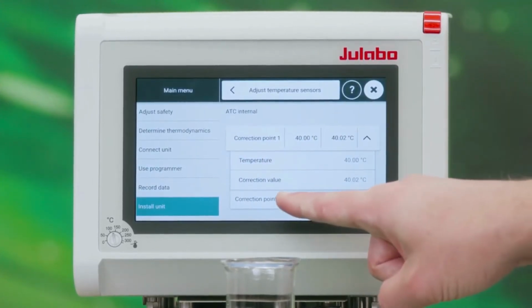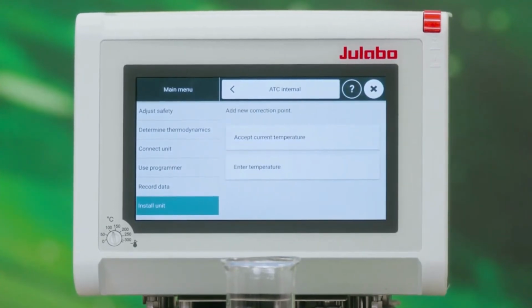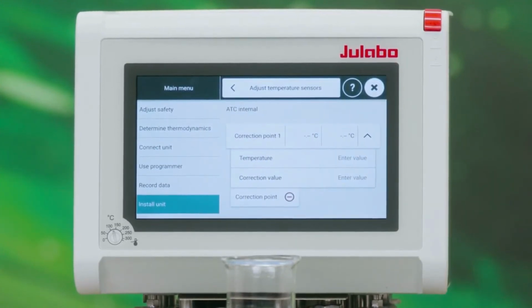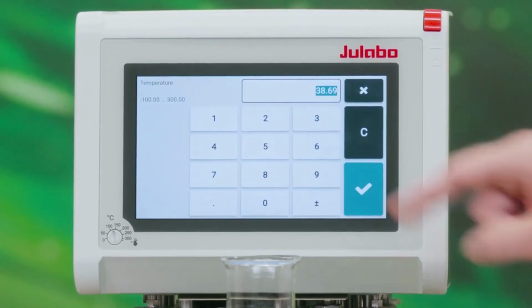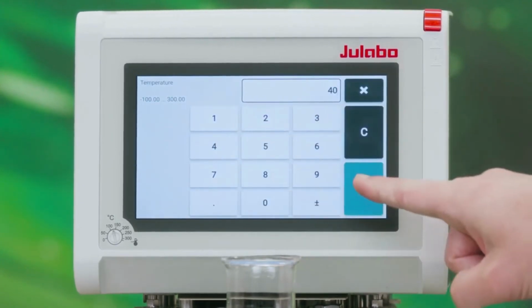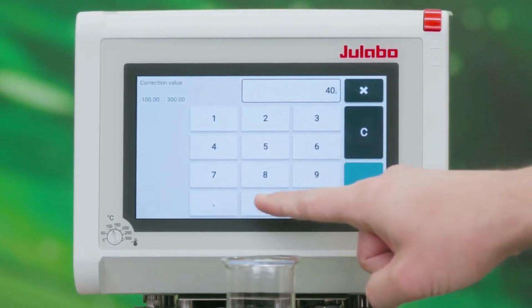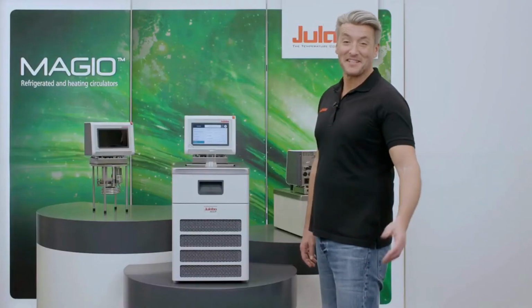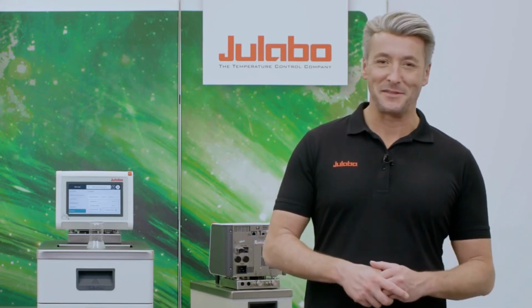To delete the correction point, just press the red minus. If you already know both values and do not want to wait for each individual temperature to be reached, you can also set the temperature and the corresponding correction value with Enter Temperature. That's it. The adjustment is done. If you need more correction points for different temperatures, no problem. Up to 10 points are possible.